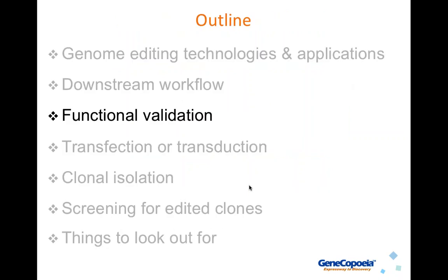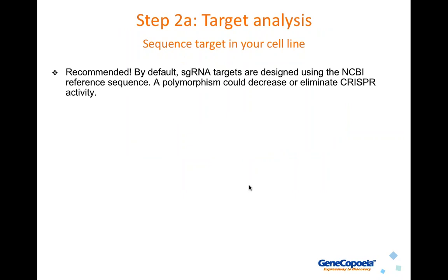Okay, now I'm going to talk about functional validation. So what do I mean by functional validation? Well, this comes in several different formats. Now, by default, the single guide RNAs are not functionally validated. We design them using the reference sequence, the NCBI reference sequence. So, they're not functionally validated.